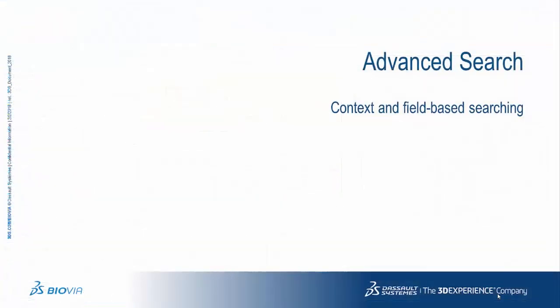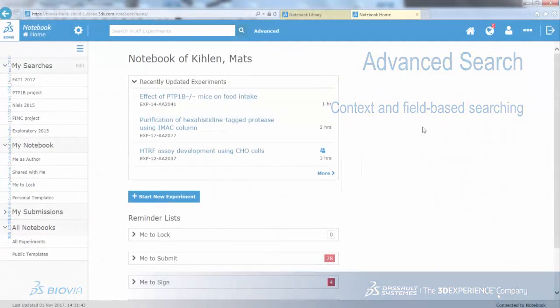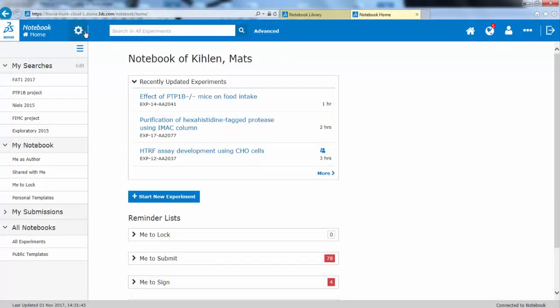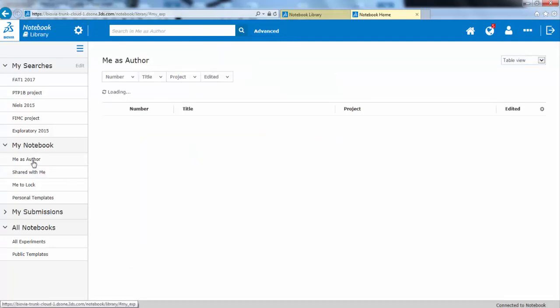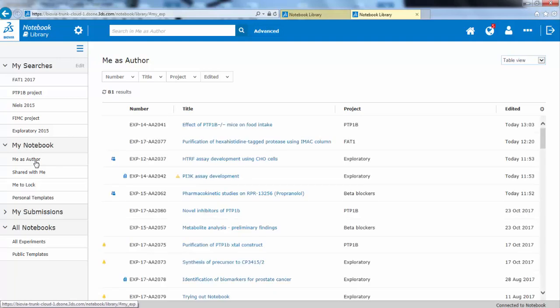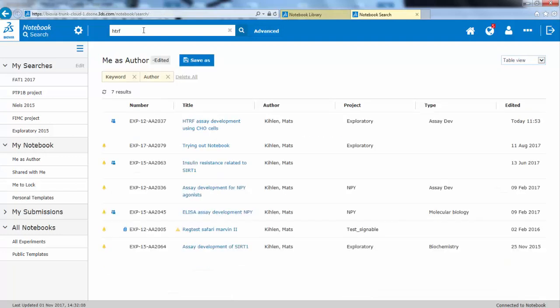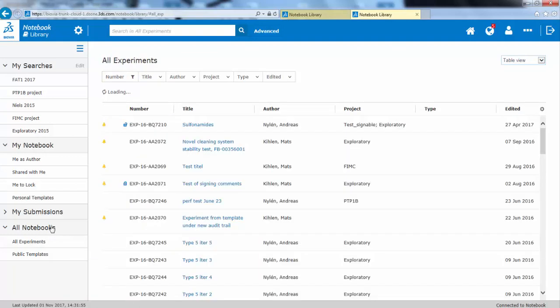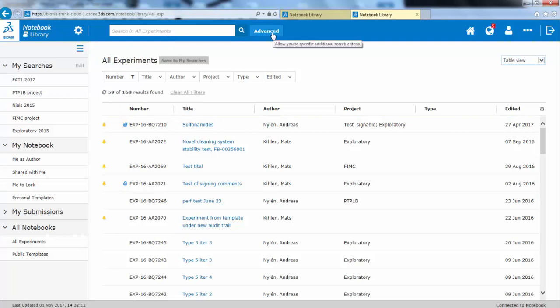The search function is placed on the top bar and is always available, and it is context-sensitive. So if you have filtered through me as an author, then the search bar will now apply only to this list. If you go to All Experiments, for instance, you will search in every user's experiment. The advanced search gives you abilities to search more precisely.